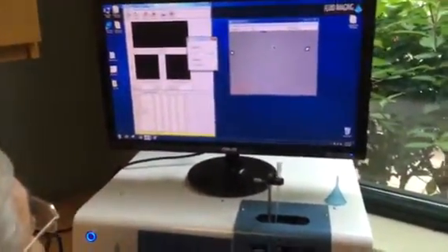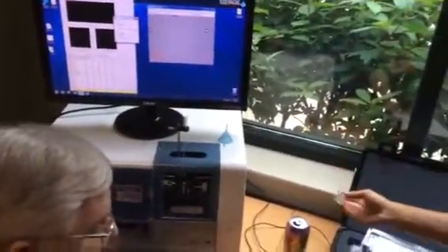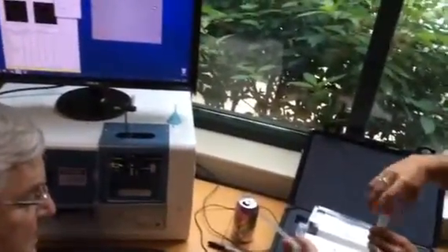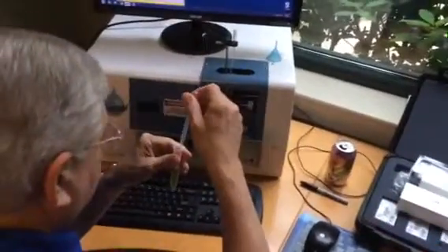And before we start the pump, we need to add some sample. Right. Because your sample settles so quickly, I would make sure that we give it a very gentle agitation beforehand to make sure it hasn't settled yet. Okay, to use this one again? Yep. It should be fine.